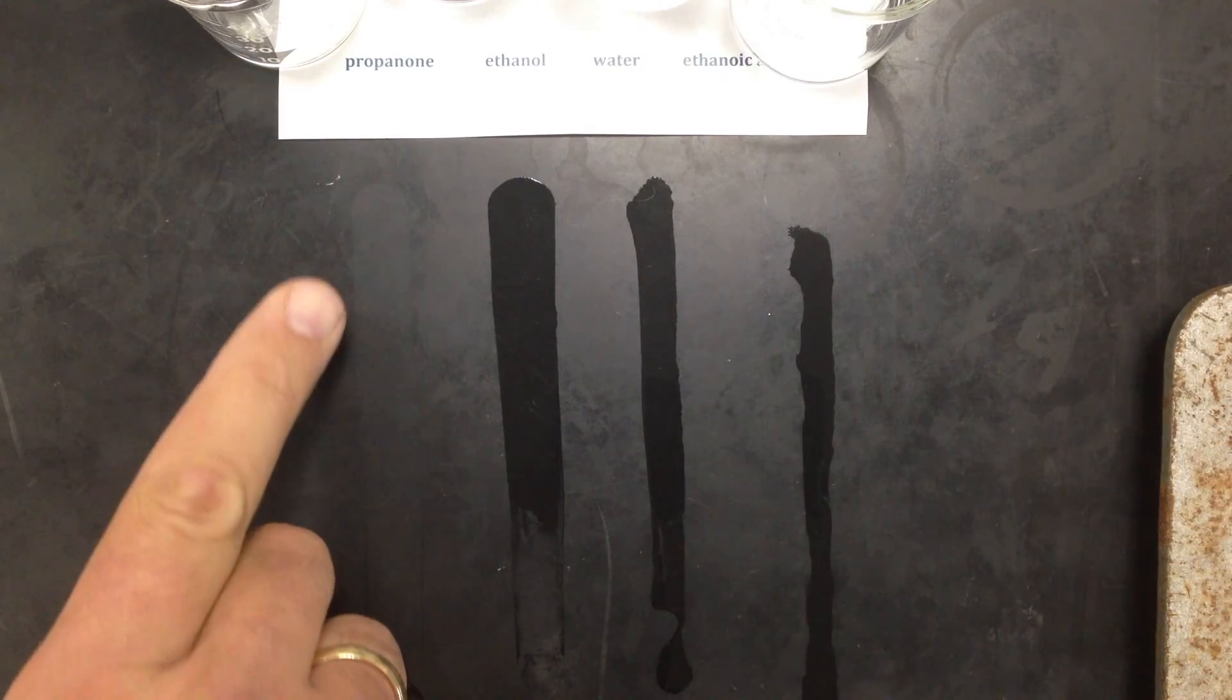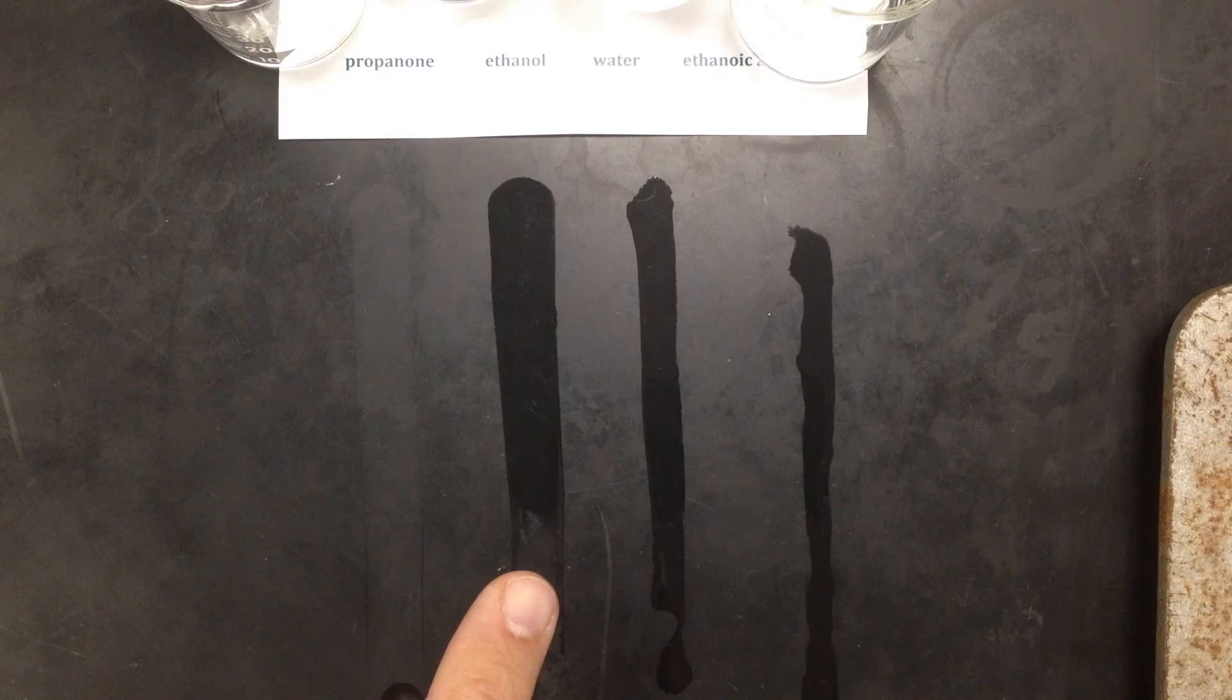So clearly the first two liquids, the propanone and now the ethanol, have the highest vapor pressure because they're escaping into the gas phase faster.